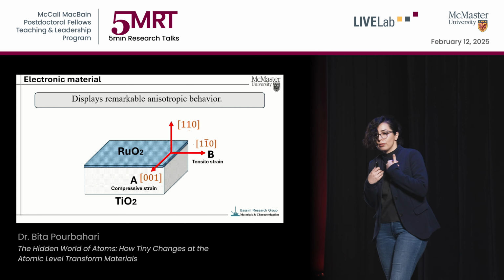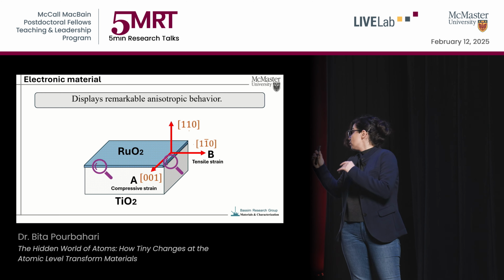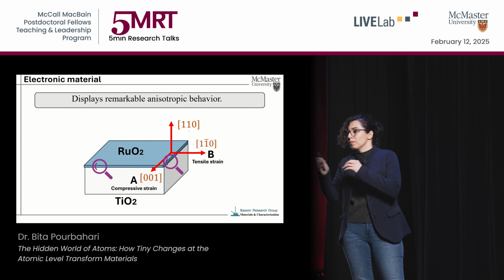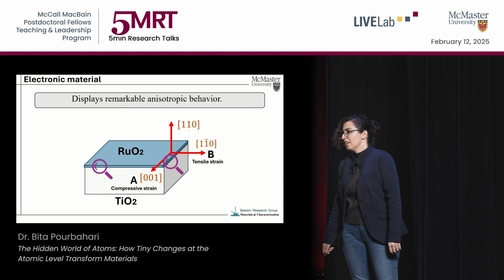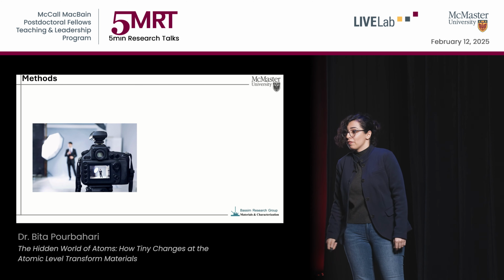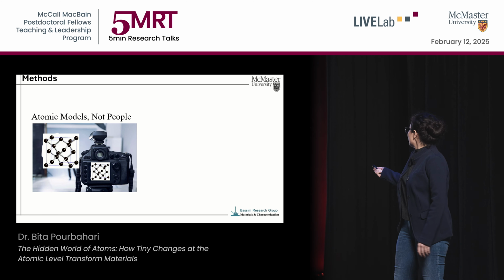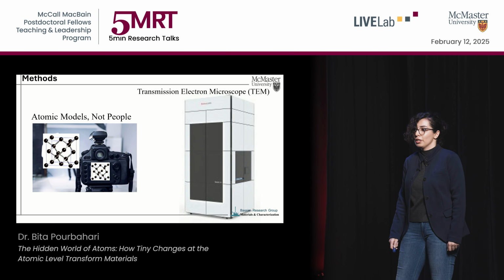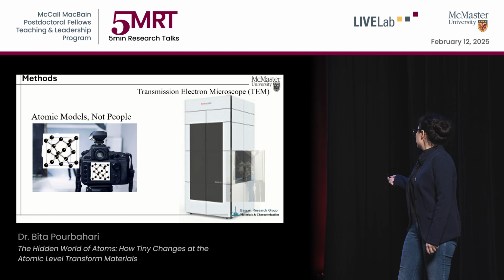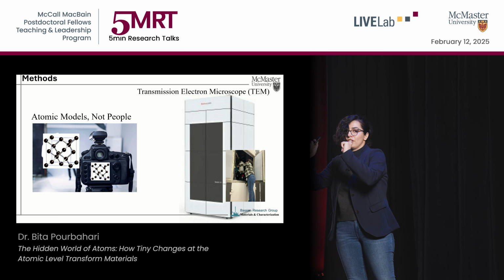They came to our group and asked us to look at the interface of these two layers and how the atomic positions of this material are. Actually, I am not an engineer. I am a photographer, but my models are not people. My models are atoms. And my camera is a transmission electron microscope, and you can see that it is two times higher than my height. So I put the sample inside the microscope and take the picture.